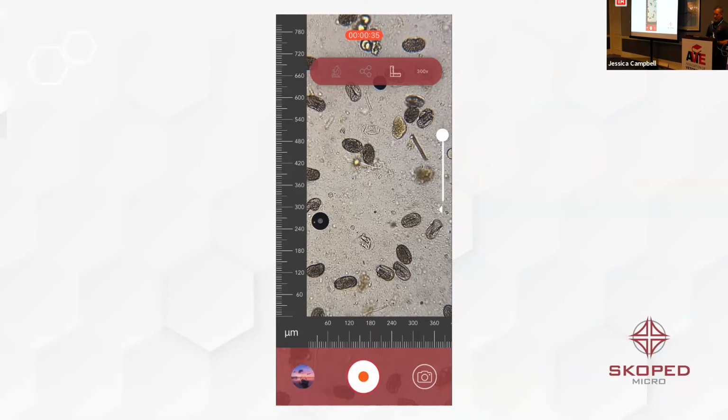And then we also worked on this micrometer. And that's been the hardest thing, is how to not only do it on my phone, but to be able to do it on your phone and your phone and your phone and everybody's microscope that you already own.